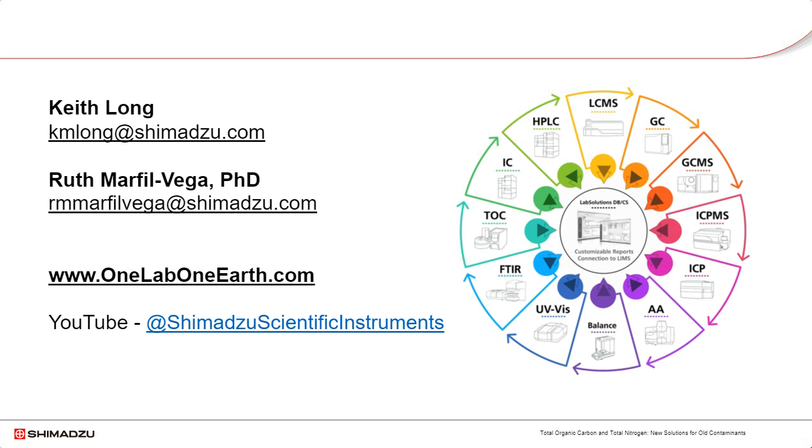If you actually use the new software, the screen in the window where you control the instrument, insert your methods, and run the instrument is very similar. It looks the same. You probably won't even notice much difference. The change is on the back end of the software, in what we do with the data. So now the new software is integrated into the LabSolutions Manager for protection of your data.